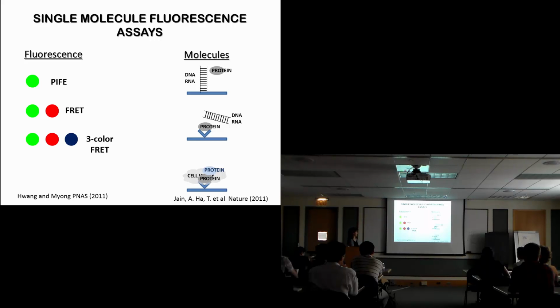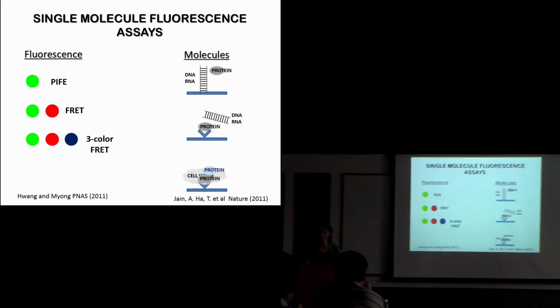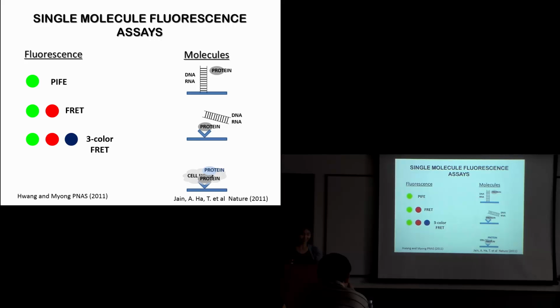This is really handy because when you pull down molecules directly from cell lysate, the molecule-to-molecule interactions, such as cofactor binding or oligomerization of the proteins, are preserved. This is very useful, and I'm still amazed that this actually works, but it works really well. I'll show you each of these cases throughout my talk. So you can interrupt me at any time point.